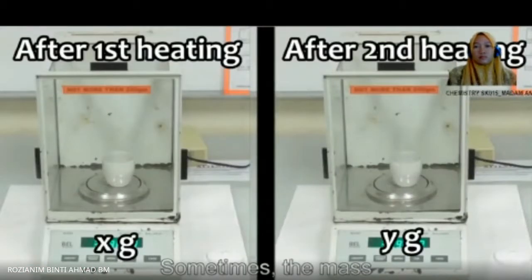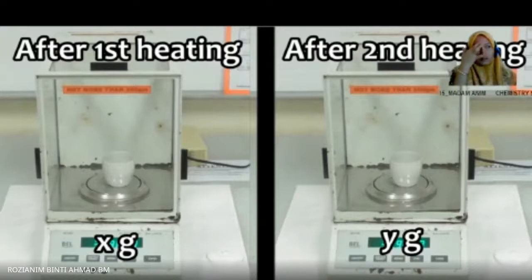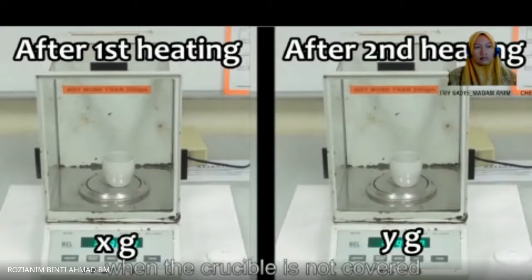Sometimes, the mass of the crucible plus mixture after the second heating is higher than the mass of the crucible plus mixture after the first heating. This happens especially when the crucible is not covered during the cooling process.